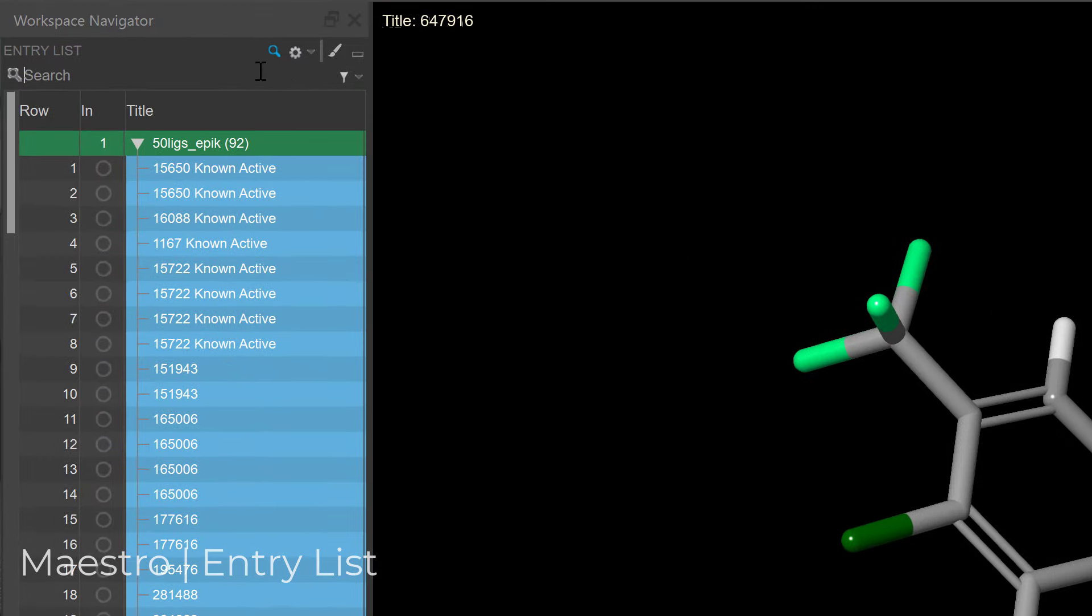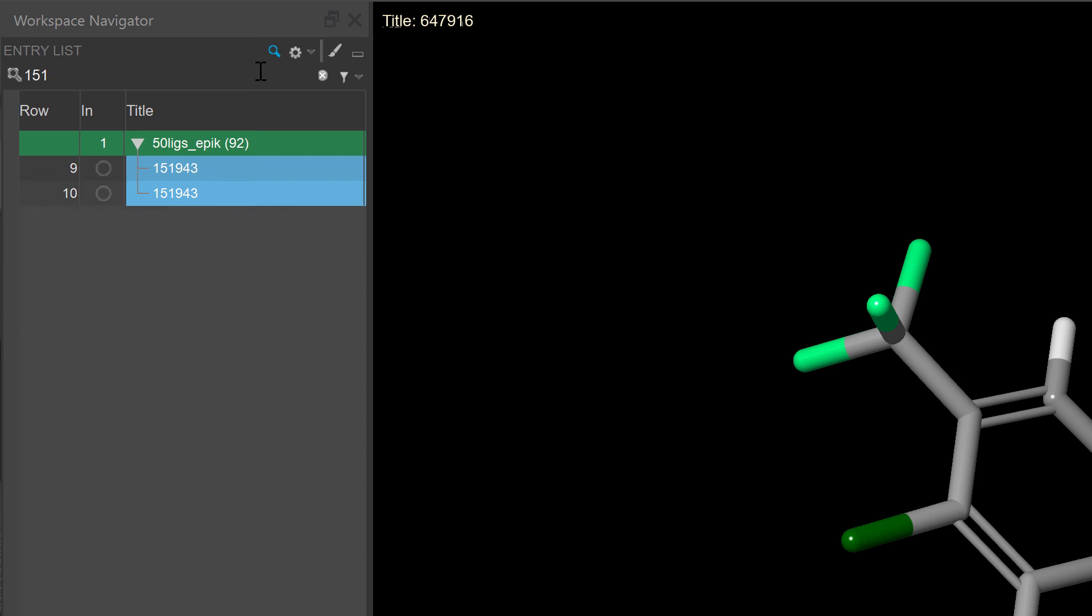In the entry list, enhanced searching capabilities is now possible with regular expressions, enabling precise and simultaneous searches for multiple entries.